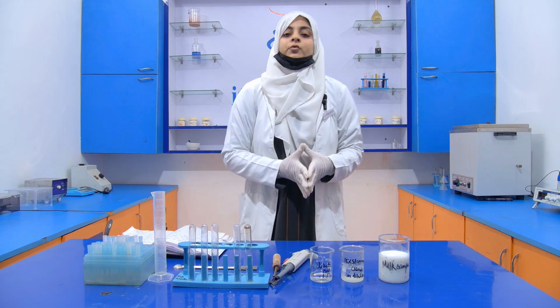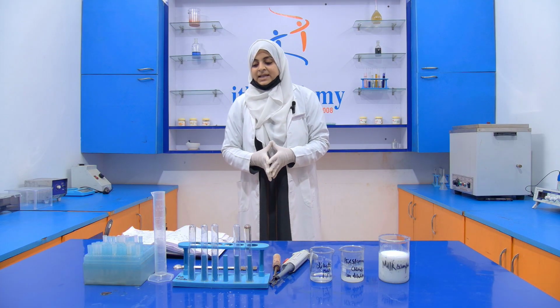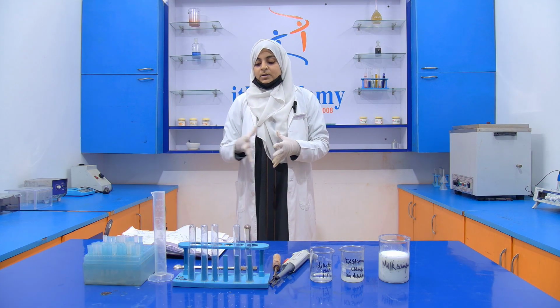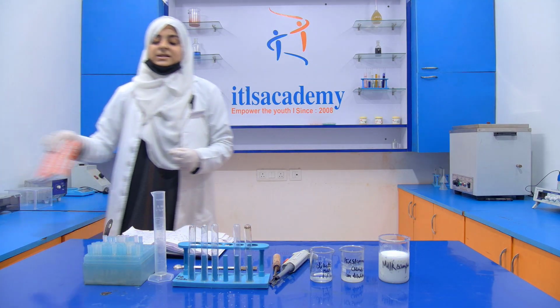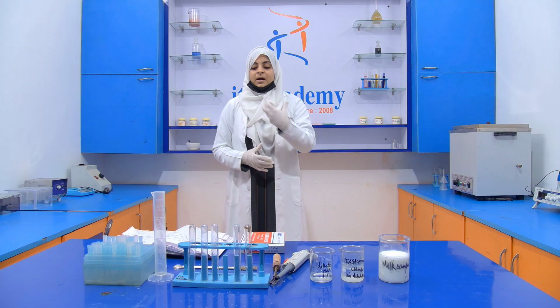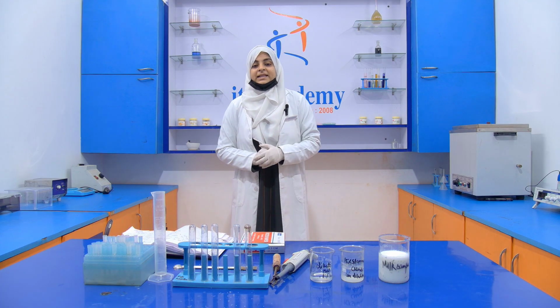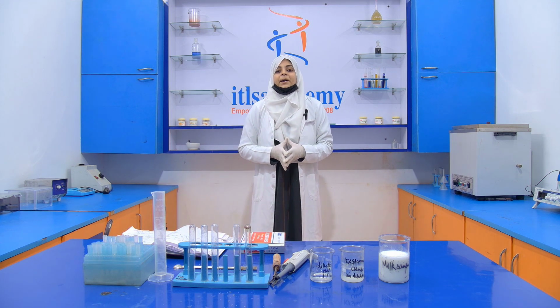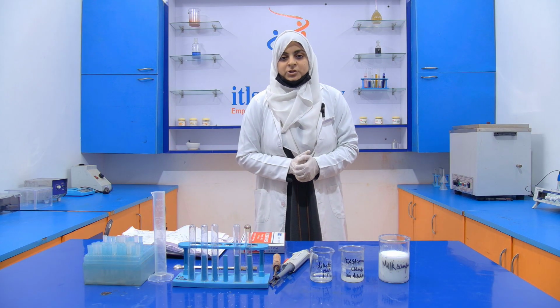Now what do we have to do? We take a 10 ml sample, and into the 10 ml sample we are going to add 1 ml of dilute HCl. Then we mix it properly, and when curdling occurs, we filter it. Then we collect the filtrate, and into the filtrate we are going to add 1 to 2 ml of the 15% stannous chloride.